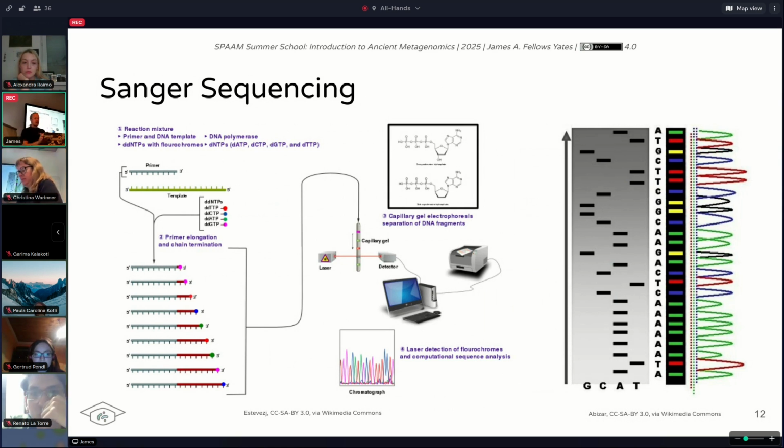Truncated. The gel then separates them out by size, and then you would record each molecule as it goes through and record the light emitted by these blocking nucleotides. As you can imagine with gels, it is very, very slow to pull all of these copies through the gel and separate them out. While it was definitely much better than what was used previously to identify DNA sequences, this was quite slow. We won't go into too much detail about this, but this is the basic concept again. You're somehow modifying lots of copies of the nucleotide molecules to different lengths, then separating them out by size, and then recording the color of the fluorophore as it goes through.